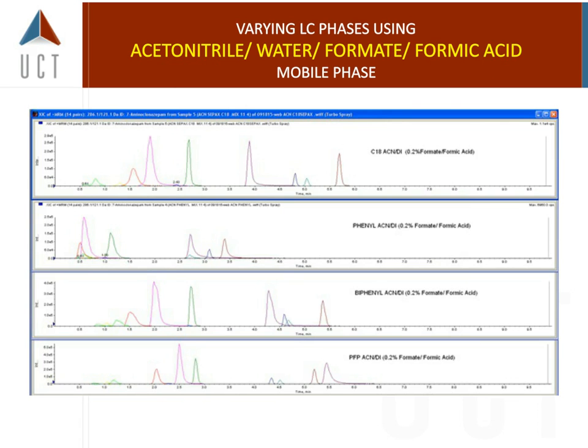Look, and what's important now, and I think what's really interesting, is look at your wash. You couldn't look at your wash solvents before, using primarily GCMS, but now you can take your wash solvents, dry them down, and if there's water or any organic, you can actually run a very quick LC-MS spectra and see if something's being washed off your column, because it would be in your wash solvent. We do that routinely in some analysis when we're trying to do new development, because we want to make sure we've chosen the proper column or that we're not washing something off of our column because of the method.